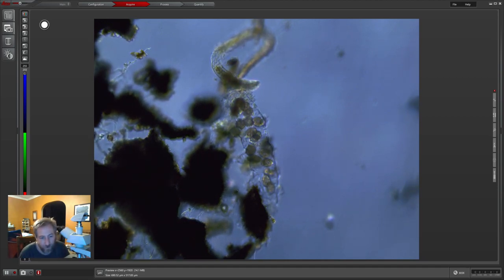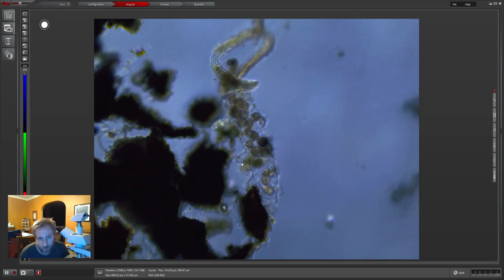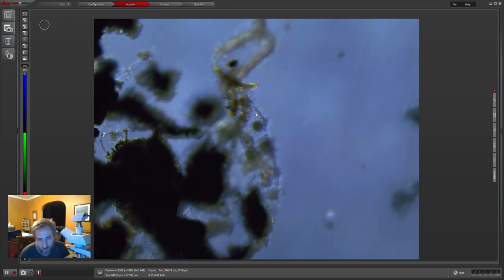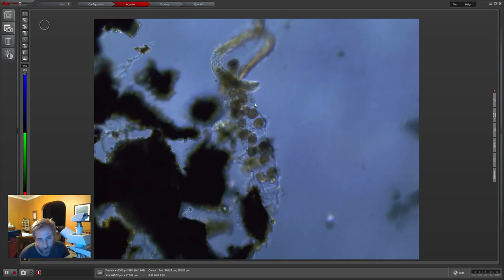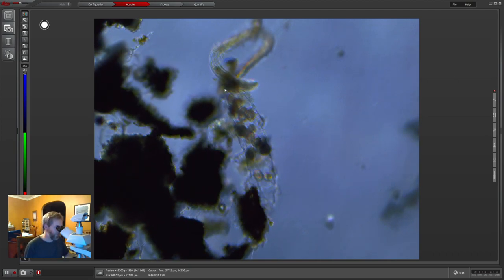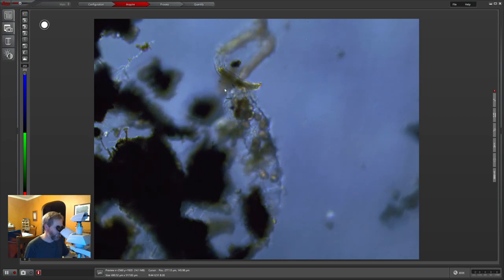This thing here in the middle of the screen is the molt from a water bear. You can see the water bear's claws right here and that's its snout. But this is just the exoskeleton, and this stuff moving around on the inside — these little pink balls — are, I think, the water bear's eggs. That's the way water bears lay their eggs: inside their previous molt. I'm expecting that eventually they'll escape from here — it looks like one of them's working its way out already. When they get big enough they'll probably work their way out.